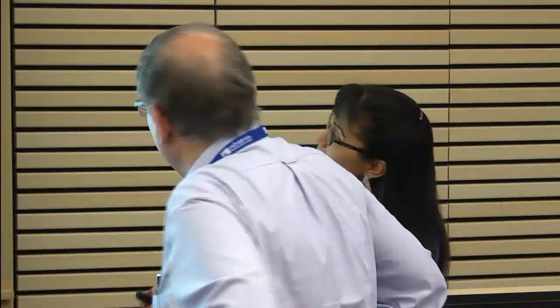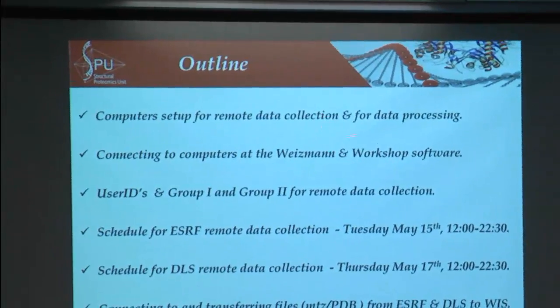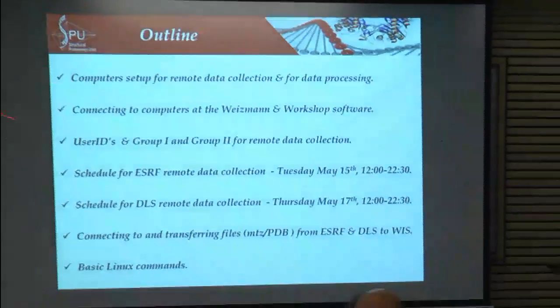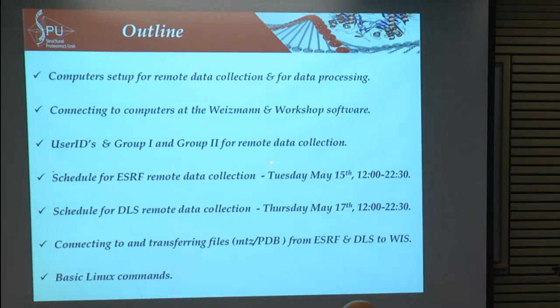First I'm going to talk a little bit about the computer setup for the remote data collection and for the data processing. How are we going to connect to the computers at the Weizmann Institute, and use some software during the workshop. How are we going to get the user ID, and we're going to divide you into two groups. Hopefully you looked through the notes. We're also going to go through the schedule for the ESRF and DLS data collection.